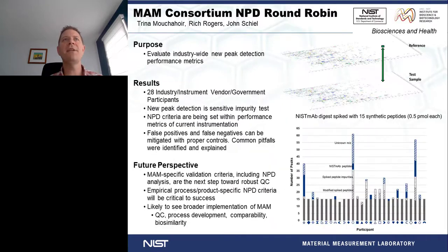So I won't be able to go through the entirety of this study today. I can give you a very brief synopsis of the results and point you to the paper that we've submitted that should be available in a few months. Looking at the bottom right-hand corner here, we're actually seeing the results from each of the individual participants. So each shape on the x-axis represents an individual pharma lab that produced their analysis.